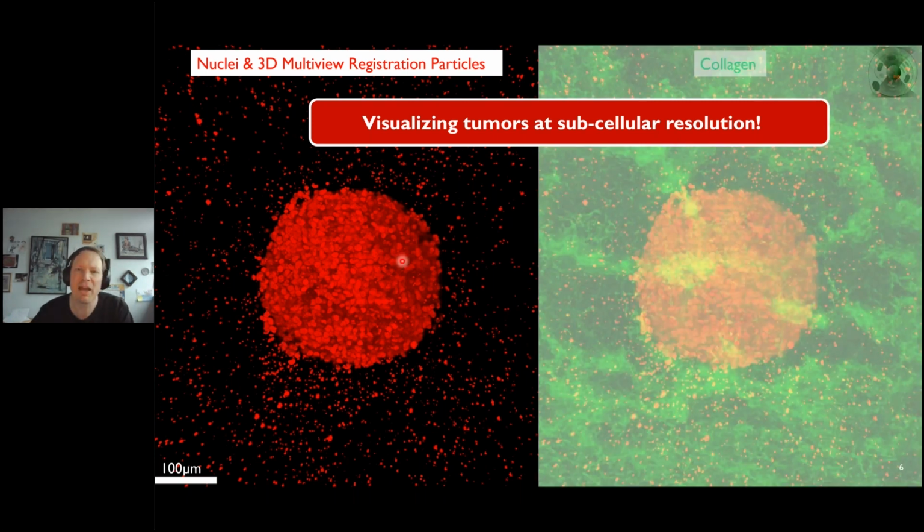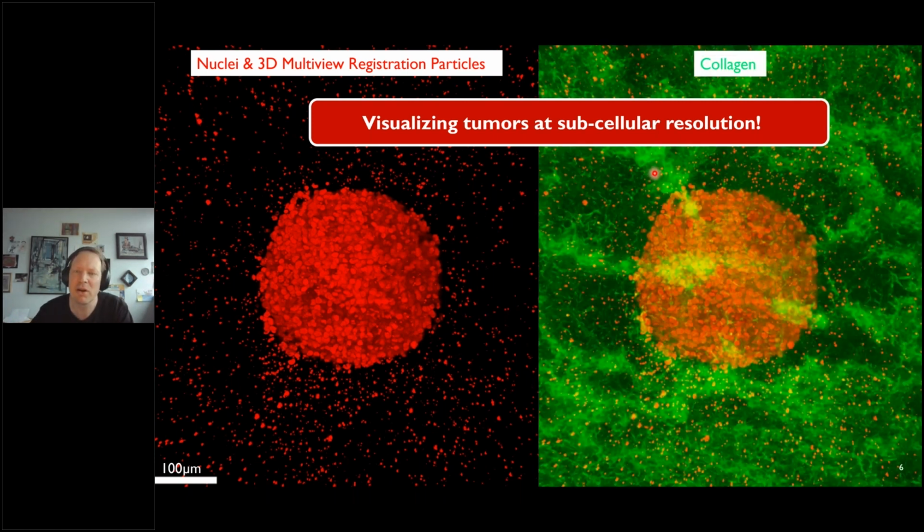In reality, what we have is the collagen here. This is just marked fluorescently. I will most of the time not show you the collagen. You will only look at the spheroid, but there is always a collagen matrix around. It's just avoided to make the images nicer.